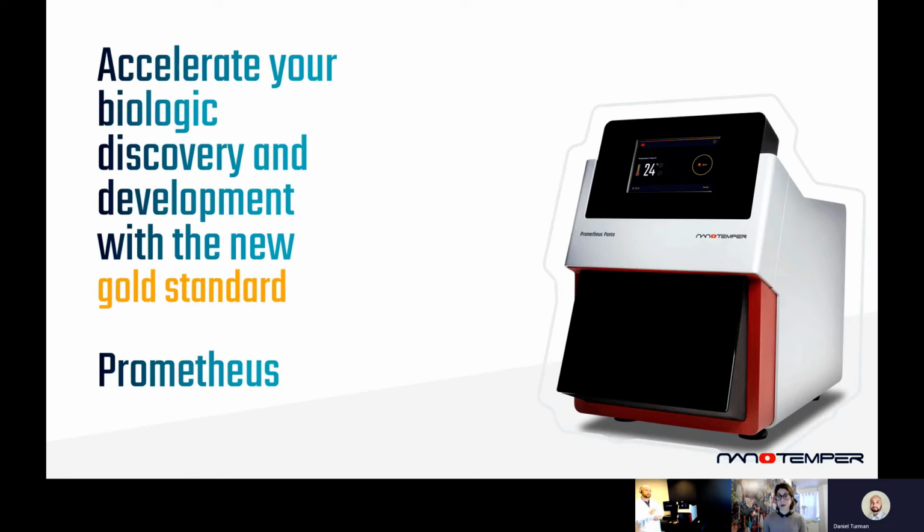Yeah, absolutely, Leah. Thank you for the wonderful presentation. So today we're going to be looking at the Prometheus Panta instrument live. So have a look here.